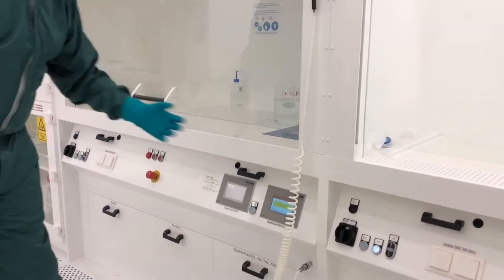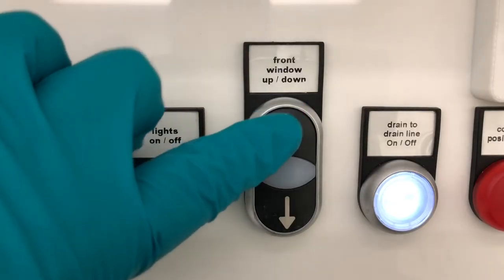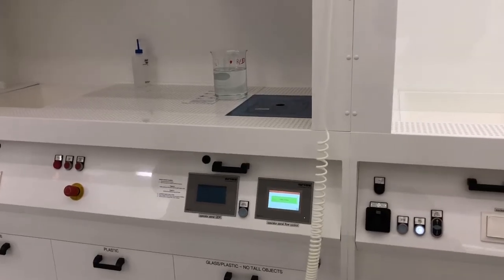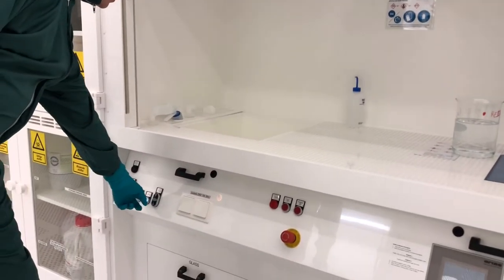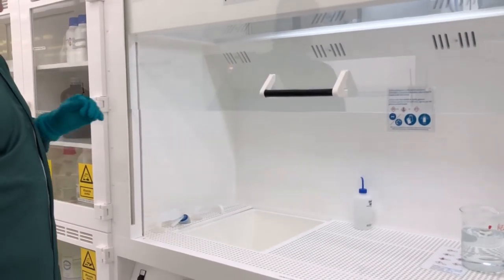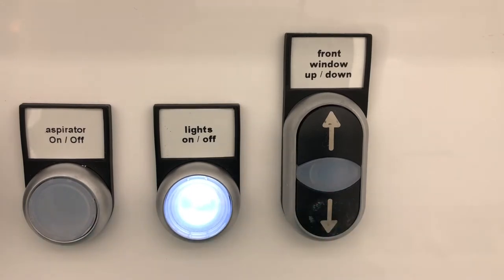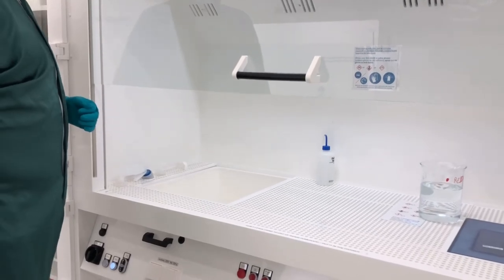The fume hood needs to be woken up from standby when not in use. Simply press the front window up arrow to start the ventilation, and the sash will open. You can switch on the lights so you can see what you are doing. Before starting your work, check that the sash height is suitable for you — try to keep it at chest height or lower. Press the down arrow to adjust the sash position, and press it again when you want the sash to stop. Now the fume hood is ready for use.